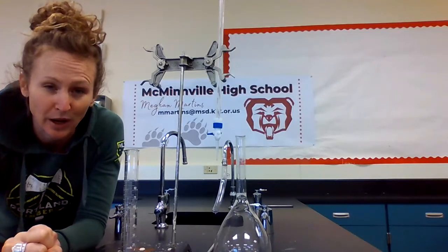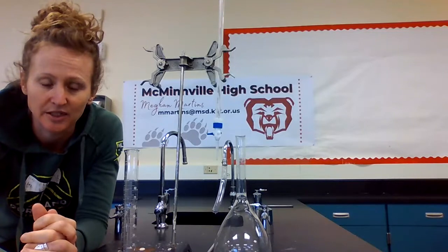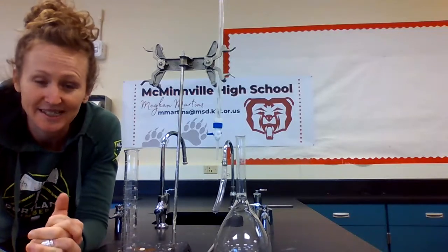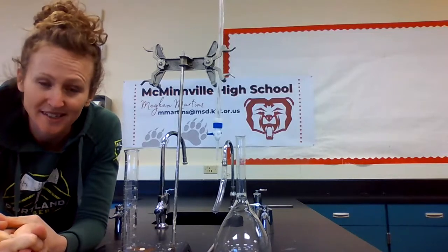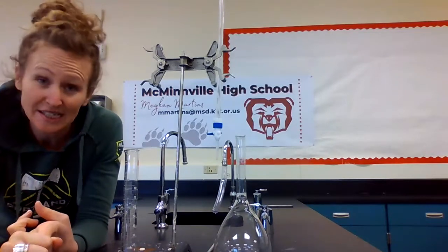This would be a good place to pause the video, think for 30 seconds, and try to come up with some ideas. What are some reasons that you can think of that we would not be able to use a spectrophotometer to analyze a solution? And hopefully, a couple reasons that you may have come up with. The solution's too dark, or it's a solid, and the light can't get through it. You may have also listed the opposite reason. The solution is too light.